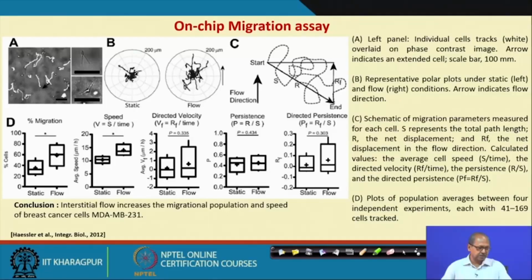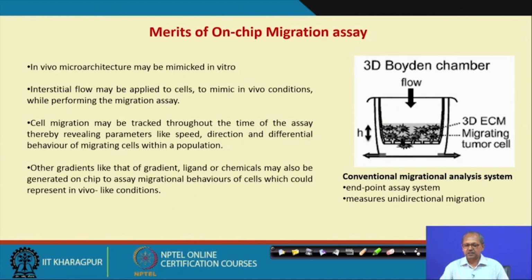This phenomenon may help decipher the metastatic potential of the cells, whereas the same experiment in the Boyden chamber will not give that much heterogeneity, because cells move from top to bottom, a one-directional flow.